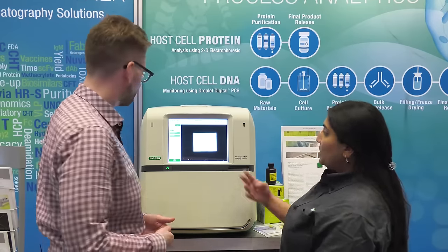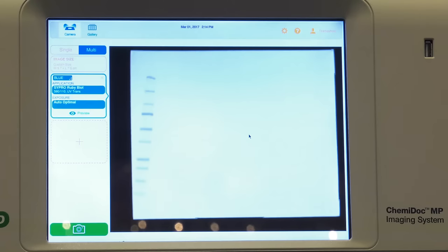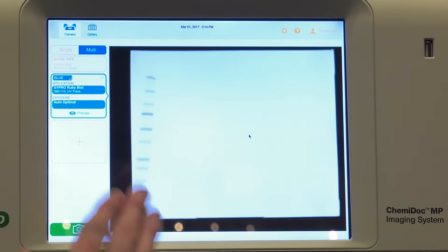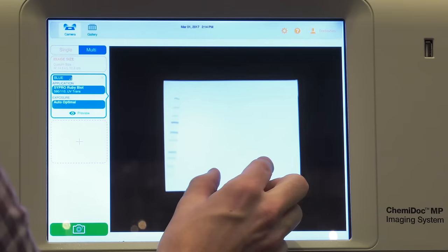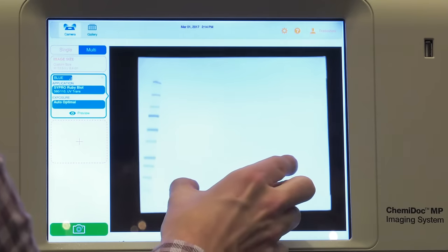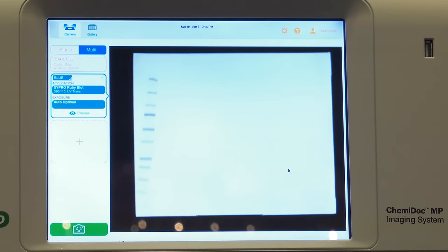Great. So do you want to walk into this software? Yeah, absolutely. So it's a really easy software to use. The design concept was that within 15 minutes a user can go ahead and teach themselves how to use the system. So that's really phenomenal. It's very, very friendly. So for example, what I'm doing is I'm just zooming in and out on, in this example, a blot.